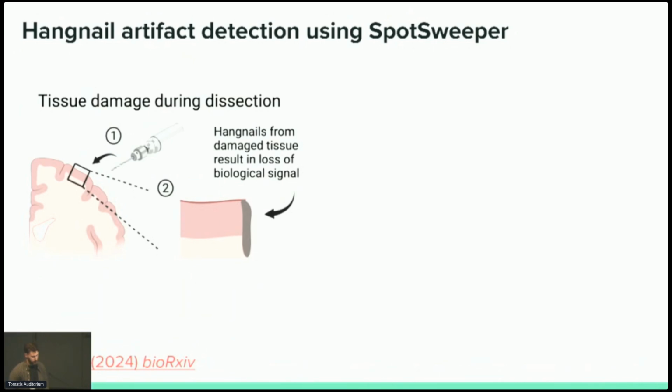Moving on to the regional area. Another unique thing about SRT is that an additional complication is that now we have these actual tissue sections. So we're taking a tissue section, which is very complicated, very thin. Now we need to place it onto a slide, and that is creating its own artifacts that are unique to SRT, and there are really no methods to find these sorts of artifacts. One I wanted to highlight here today.